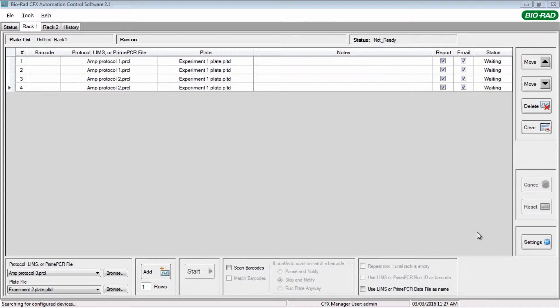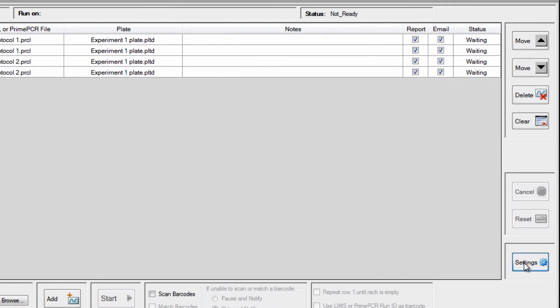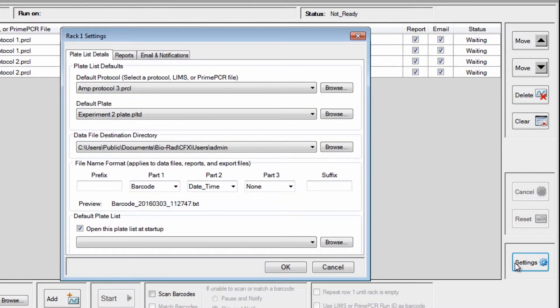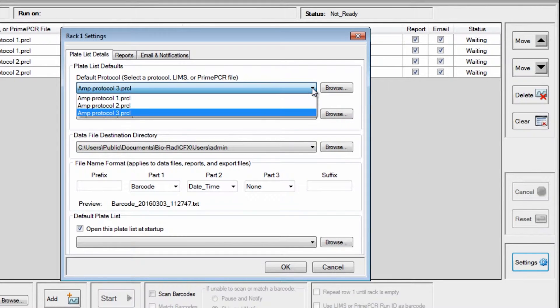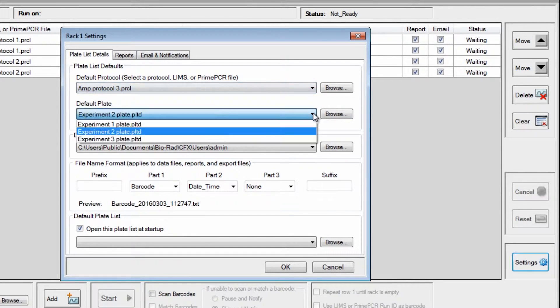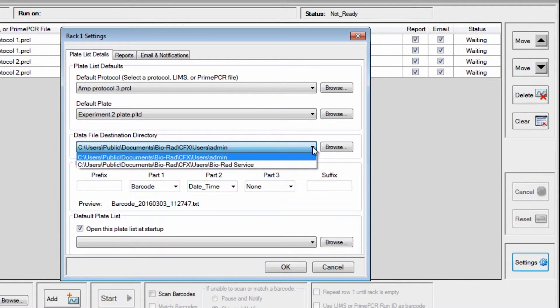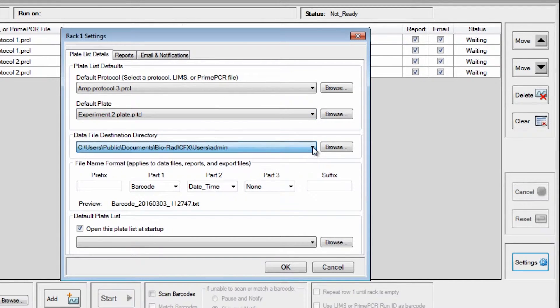On the CFX Automation Control Software Plate List page, click on Settings. Choose your default protocol file, default plate file, data file destination, and customize the file name if desired.